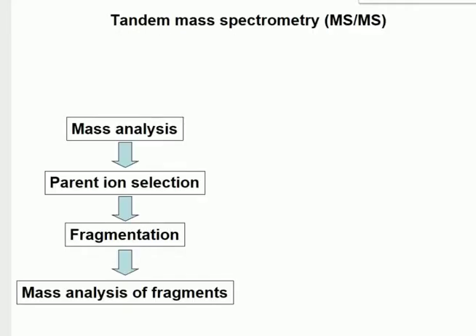Okay, so, last time I was telling you how great mass spectrometry was and it's going to solve all the problems. On its own, mass spectrometry just measures mass, okay? So if you've got a peptide, or another analyte, all the information that you get is the mass to charge of the intact molecule, okay? Which is great and can be very useful, but it doesn't give you any structural information.